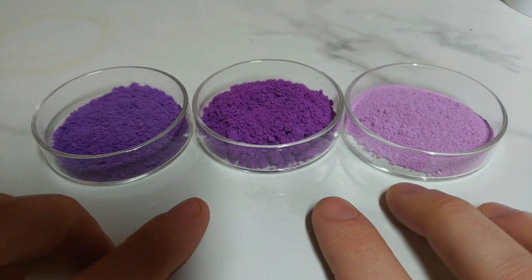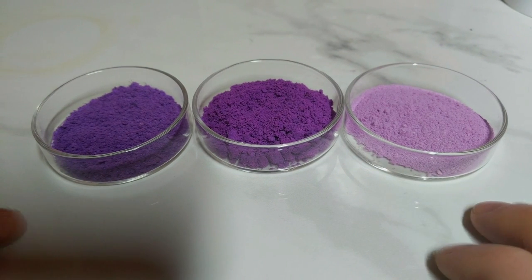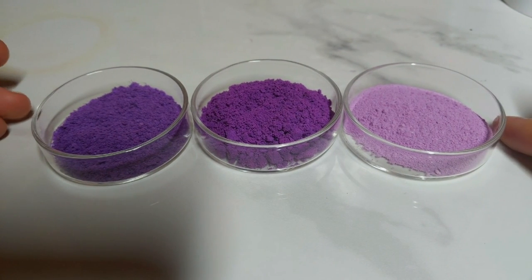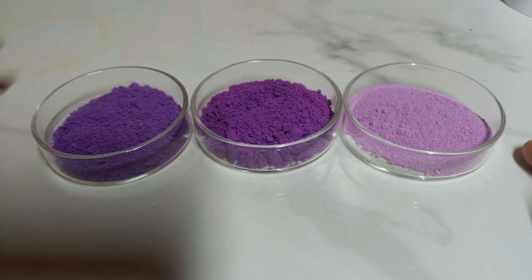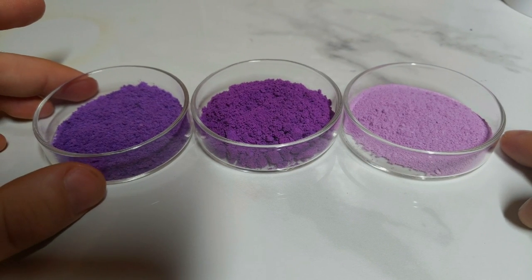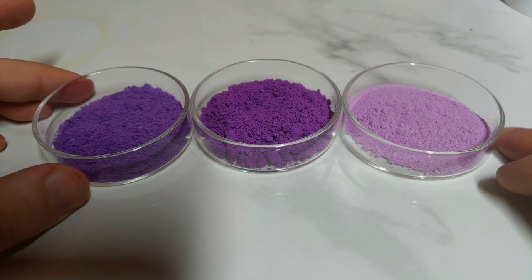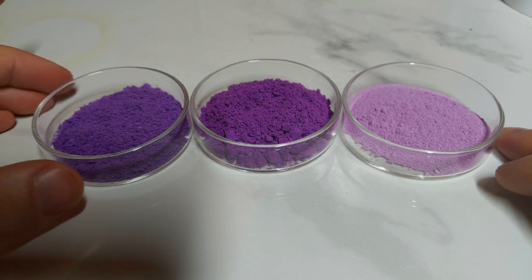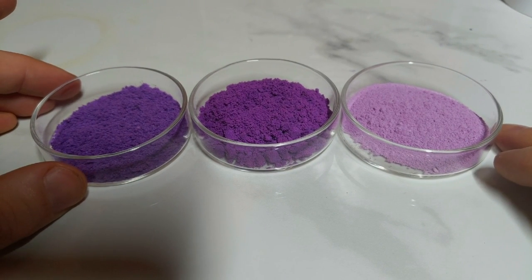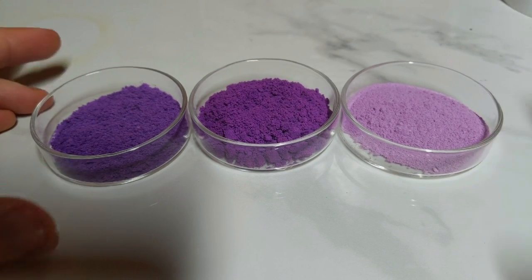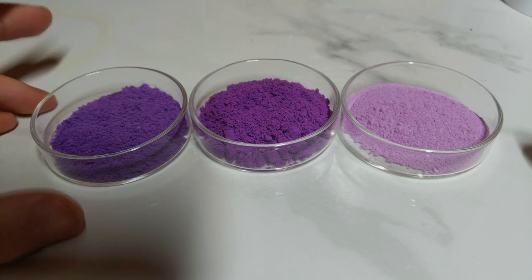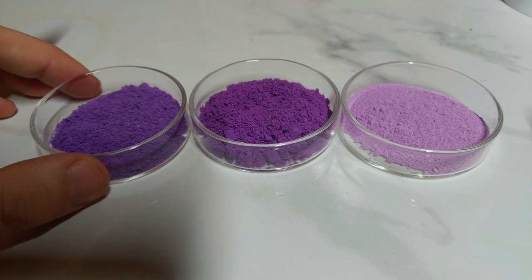But all in all, this was a pretty successful result, I think. And what I'd like to do is make a few slightly larger batches of this in the future and process it up as an oil to see how its behaviour and properties are in oil. Yeah, because I think in oil is where most colours tend to really shine and come to life. That's the beauty of oil paints.